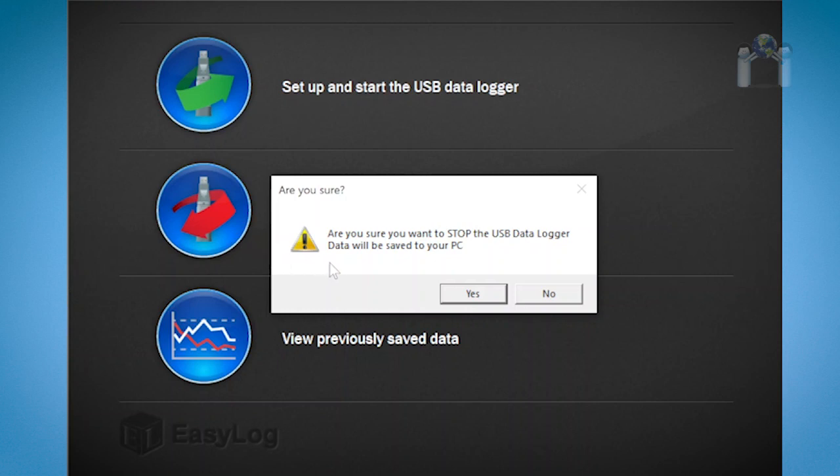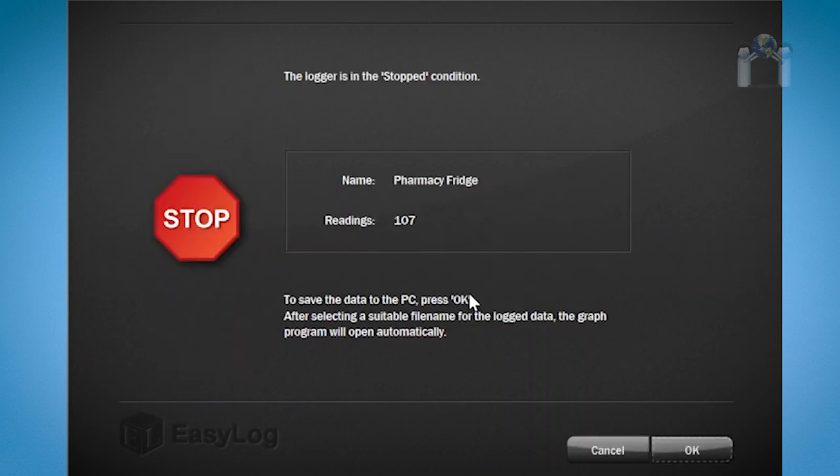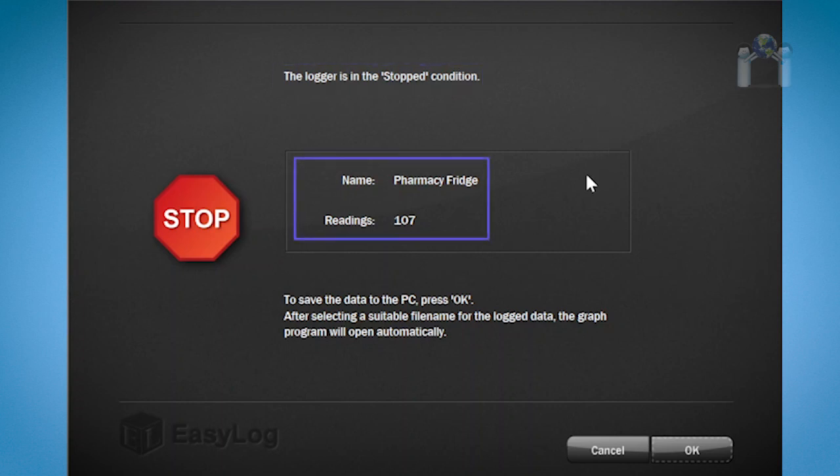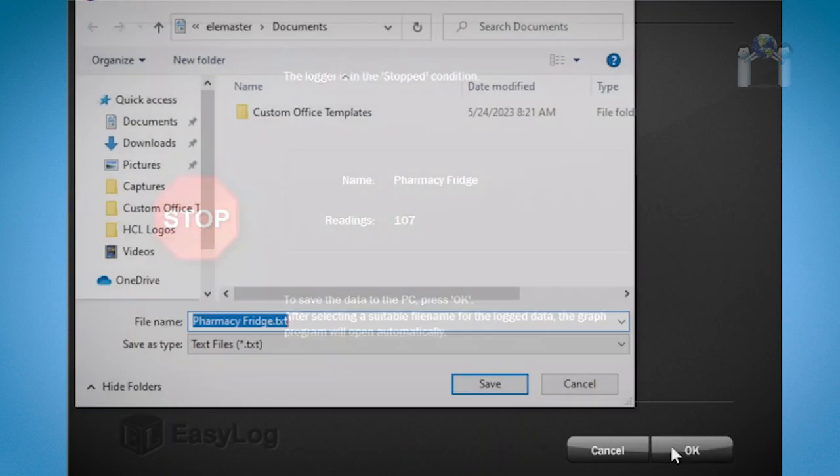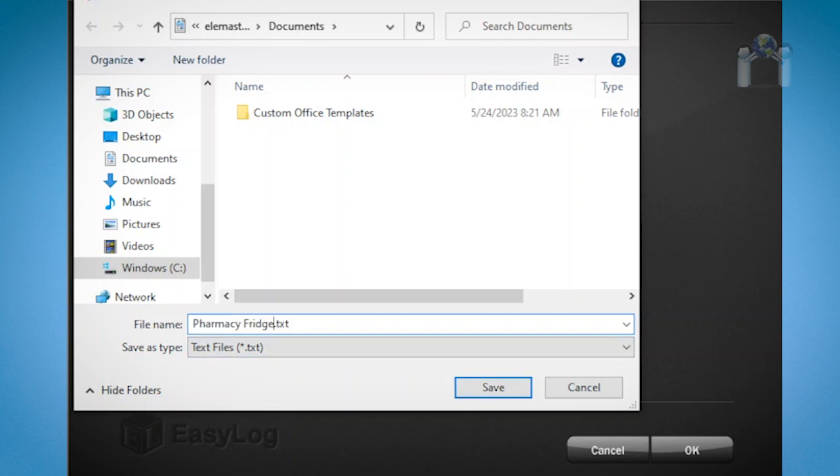A prompt will appear asking if you're sure you want to stop the logger and save the data. I will select yes. A message will appear saying that the data logger has been stopped. You will see the name of the data logger and the number of readings that it took. Press OK and a window will appear that will allow you to select where to save the file and an option to give the file a different name. Click Save.